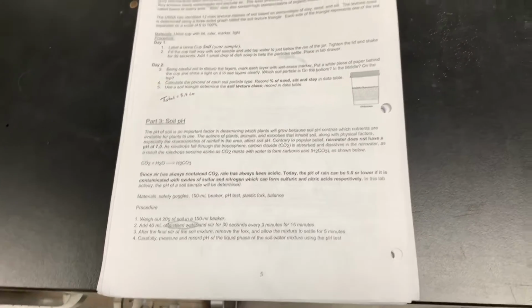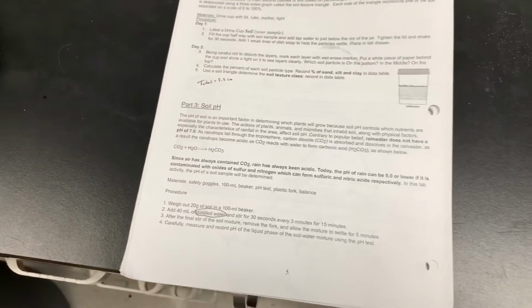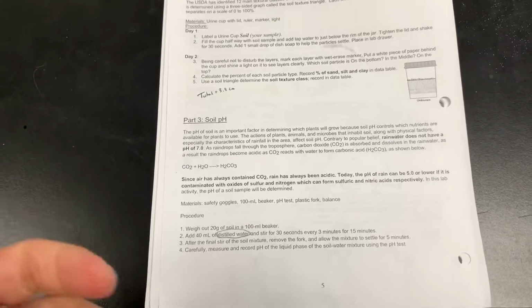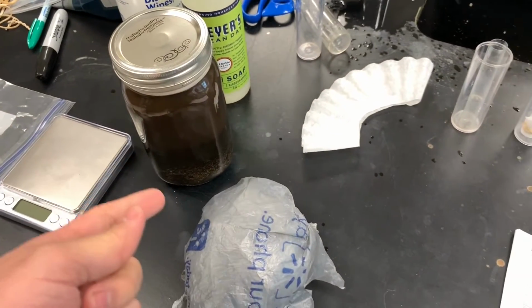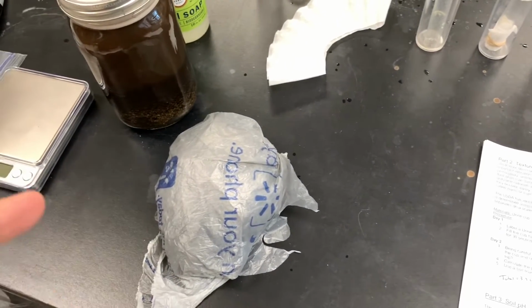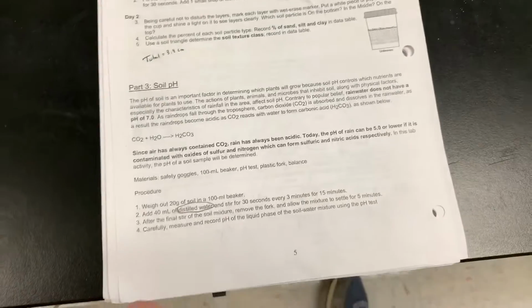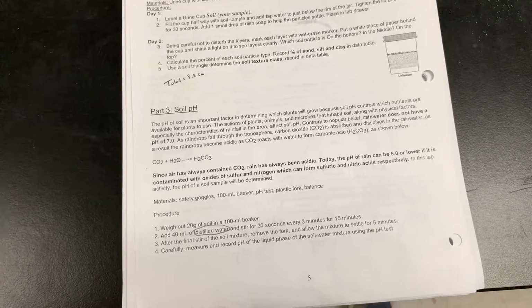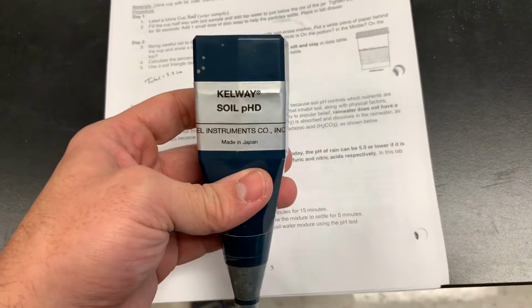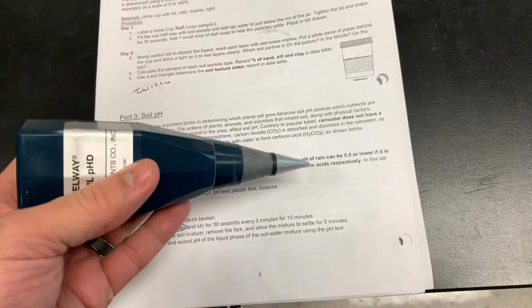Part 3 is the only part which you'll be able to complete the first day, and that is soil pH. So basically you're going to take a little bit of your sample and mix it up, and there are some directions in there. Once it's all mixed up following the directions, you're going to use the soil pH probes, almost.